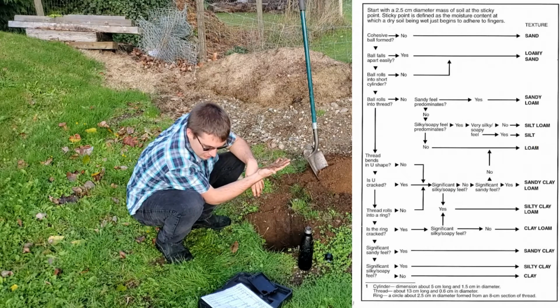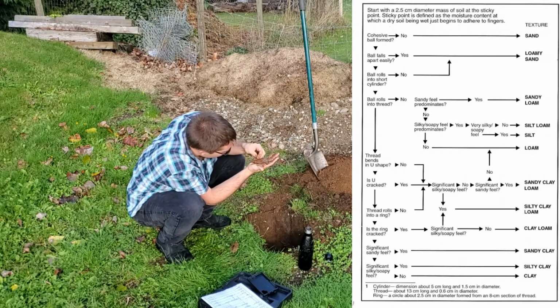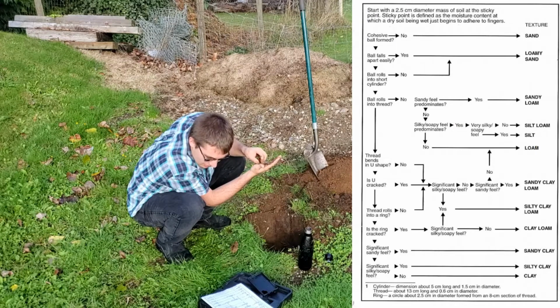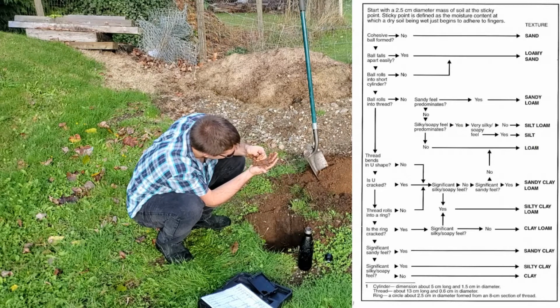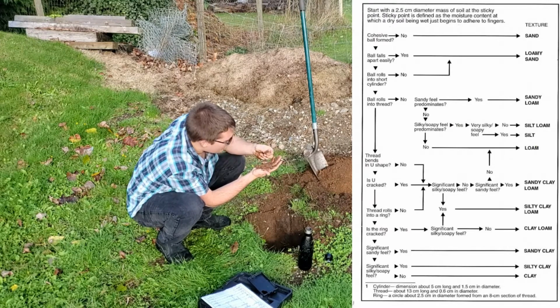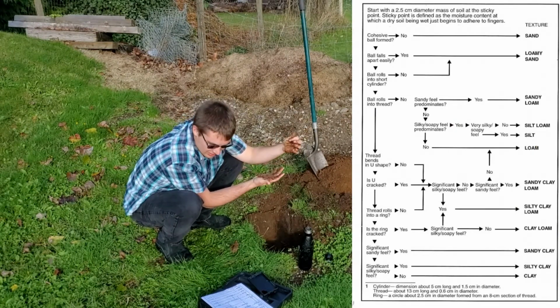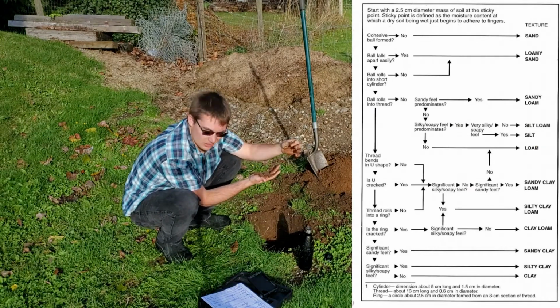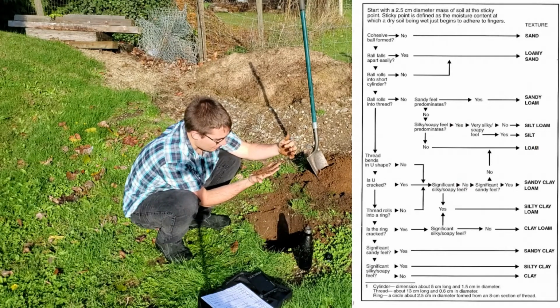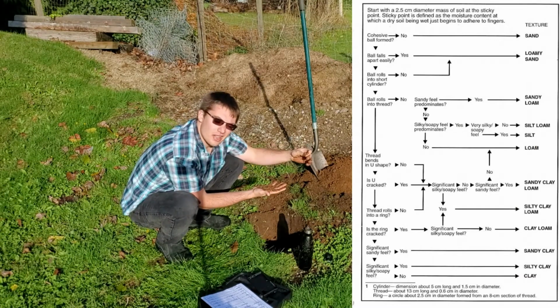So the ball does roll into a short cylinder. Yes. Does it roll into a thread? No. So we go over. So now you need to feel, does it feel sandy? There's quite a bit of coarse grit on your fingers, you can say. So I'm going to say yes, it does feel sandy predominantly. So I would say that this soil, based on the couple tests that I have done, would be a sandy loam.